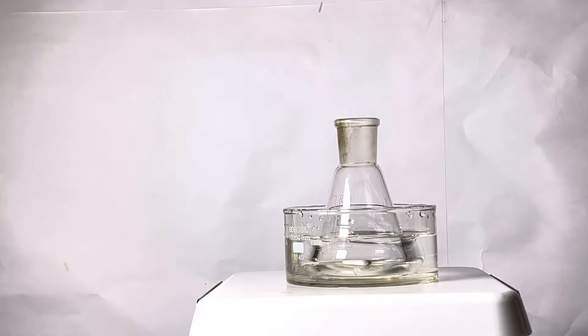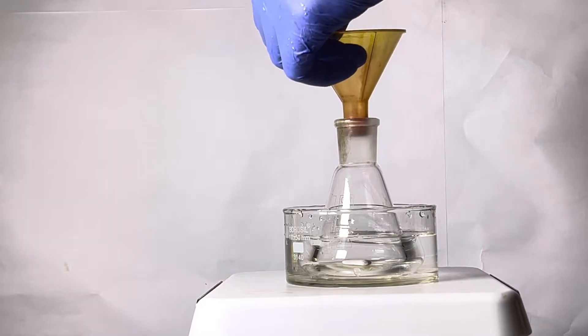A 100 milliliter Erlenmeyer flask was placed in a crystallizing dish containing water on a hot plate stirrer. A stirring bar was also placed inside.